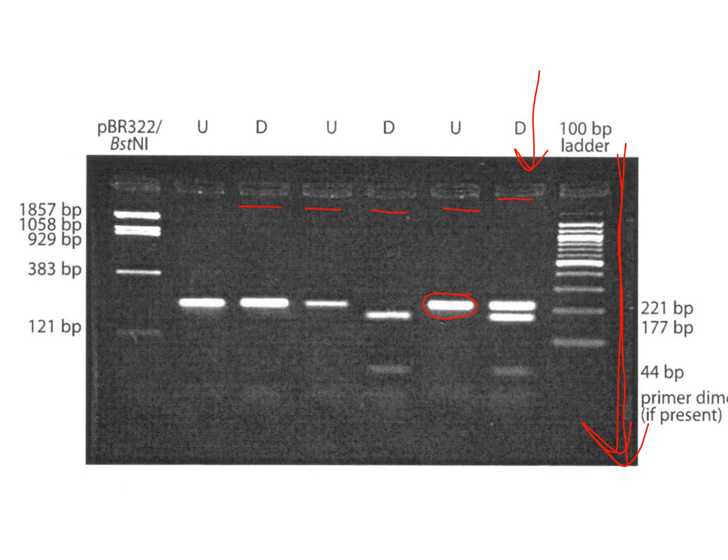So these are some measurements here. If DNA moved to this level, they're 44 base pairs long. If they moved here, they were 221 base pairs long. And up here on this side, it shows the longest fragment of 1,857 base pairs long.